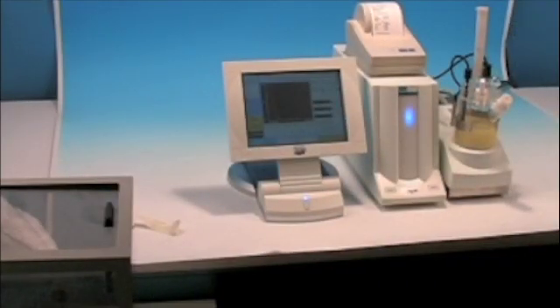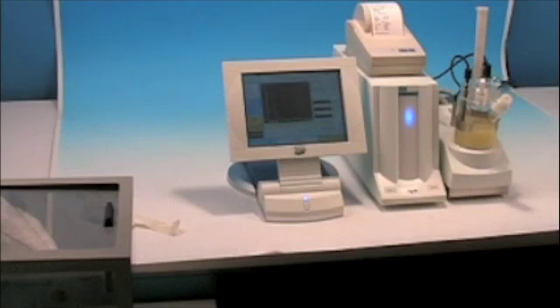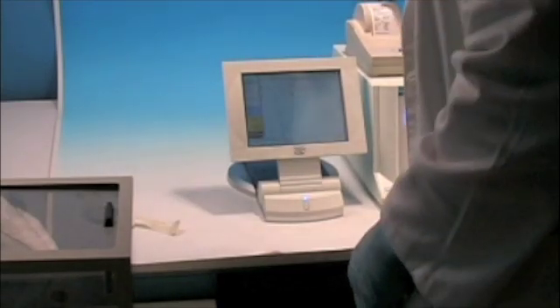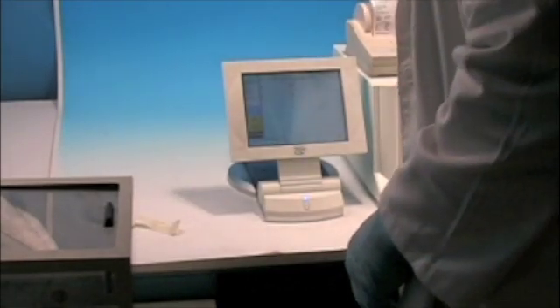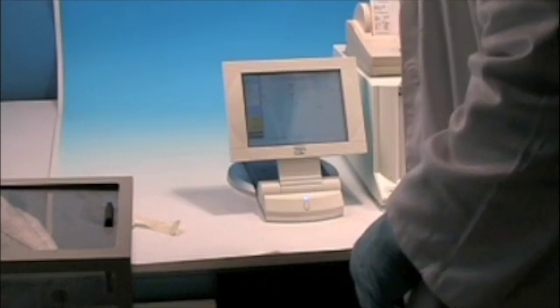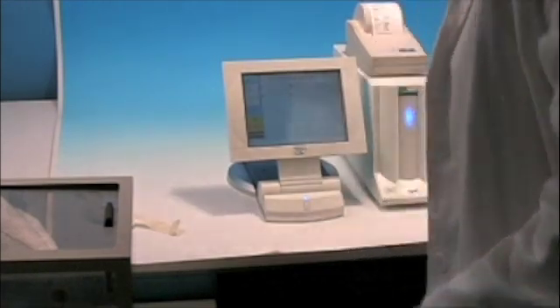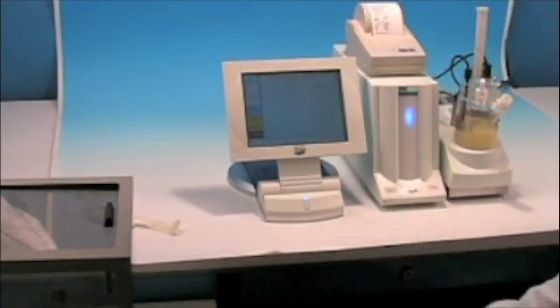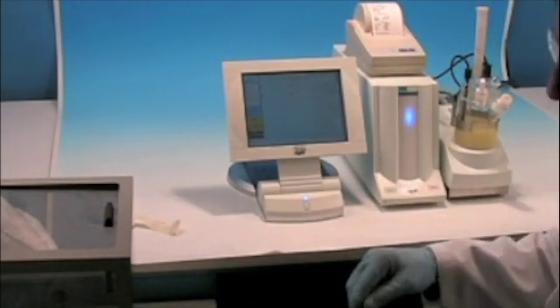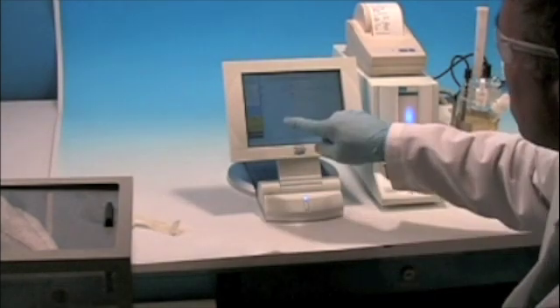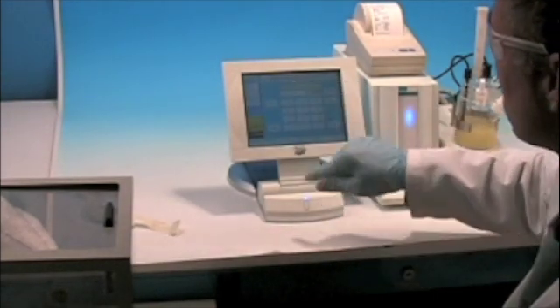Finishing up our third test. They're running just around two and a half minutes. Two minutes and 44 seconds on the second, and two minutes and 41 seconds on the first. So it prompts us for our weight.